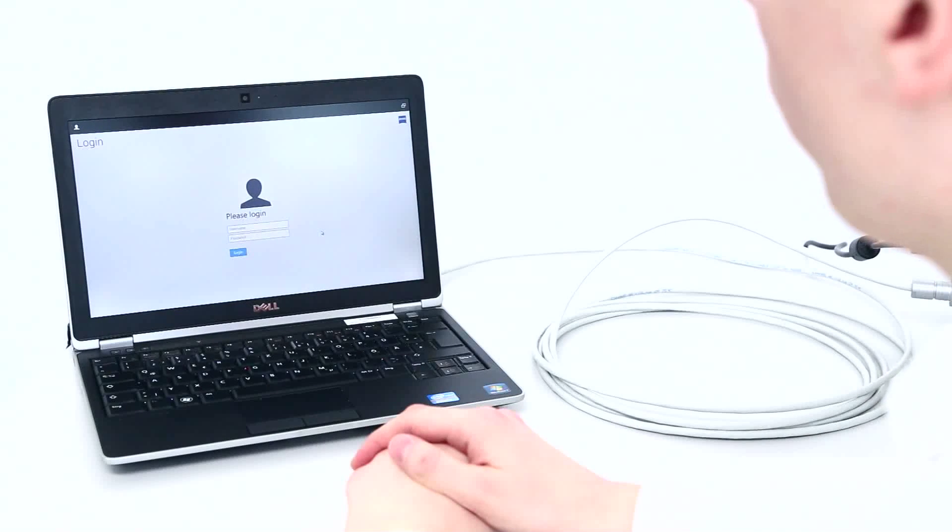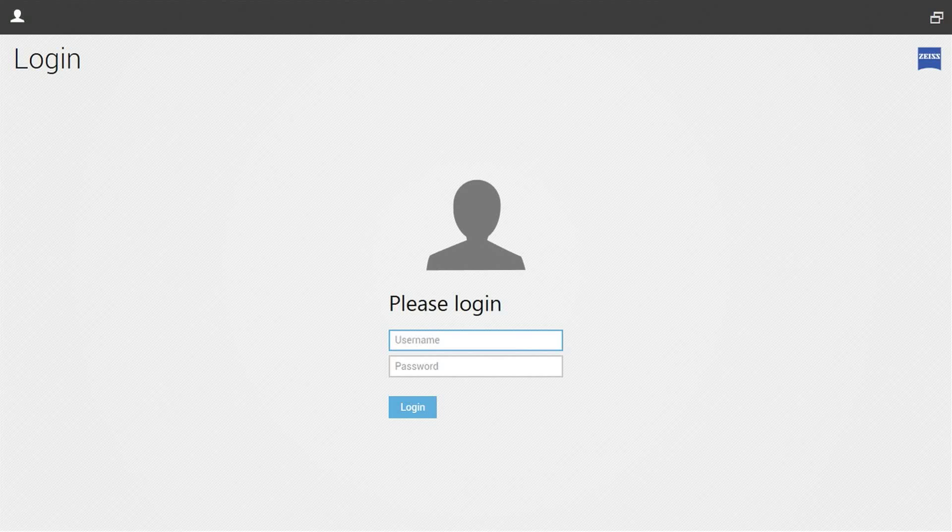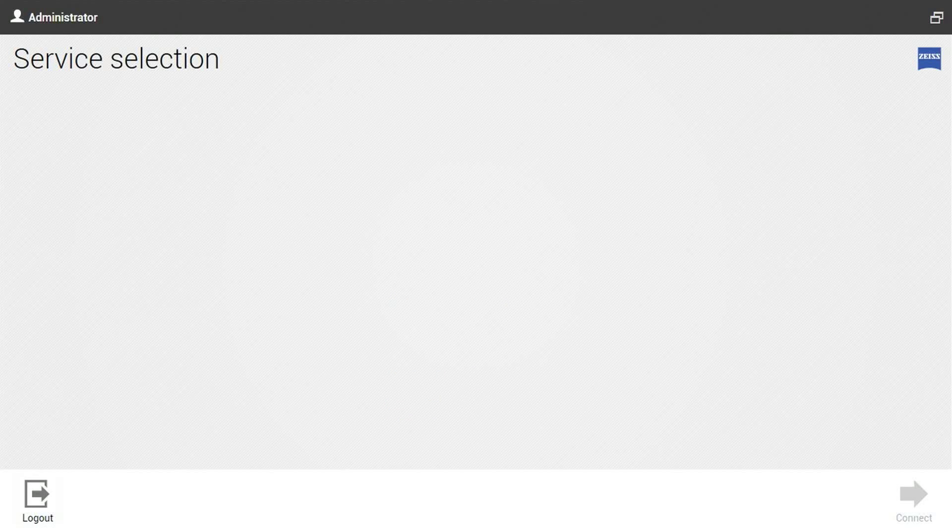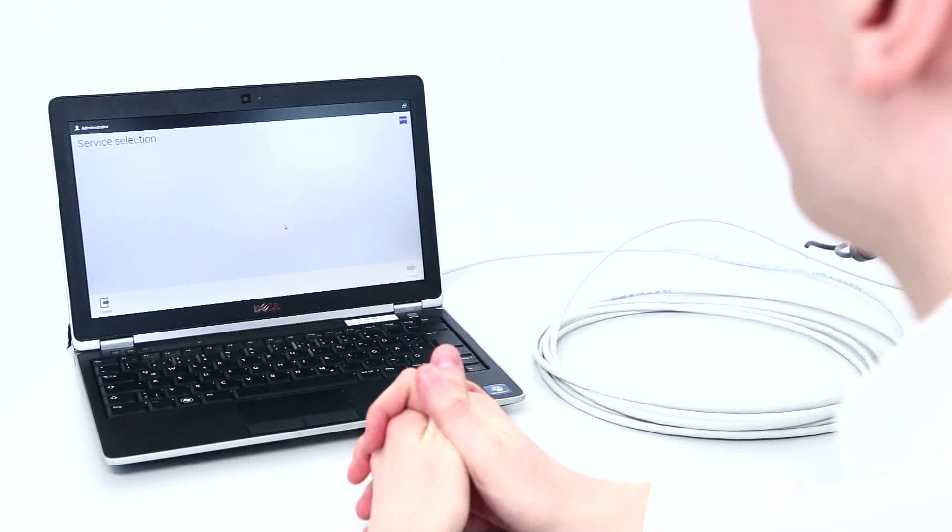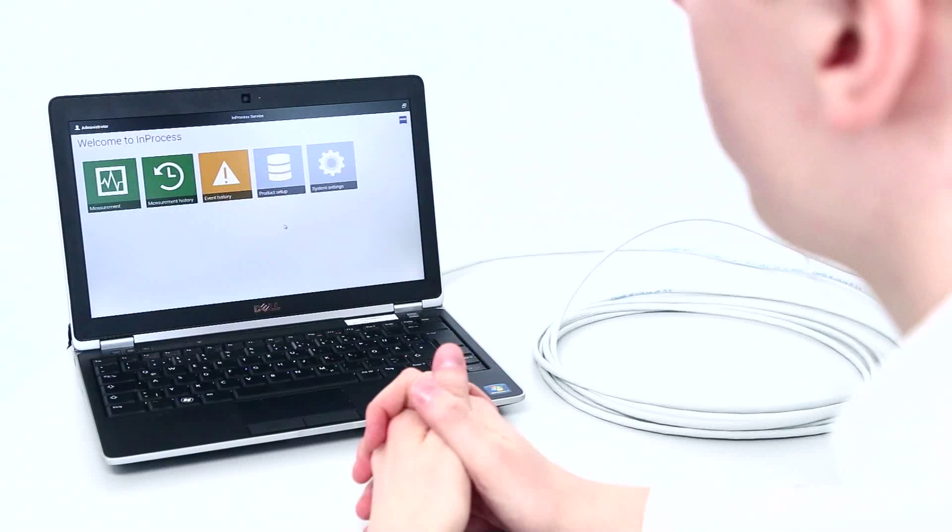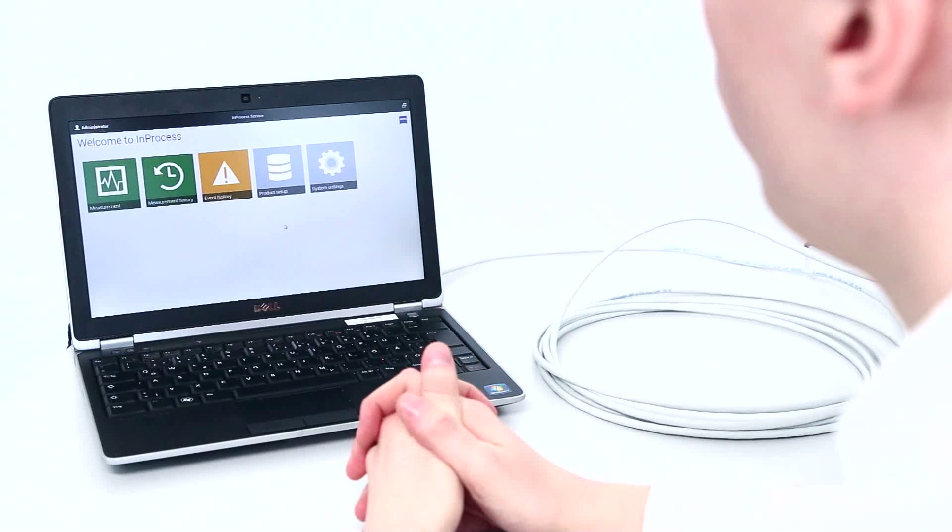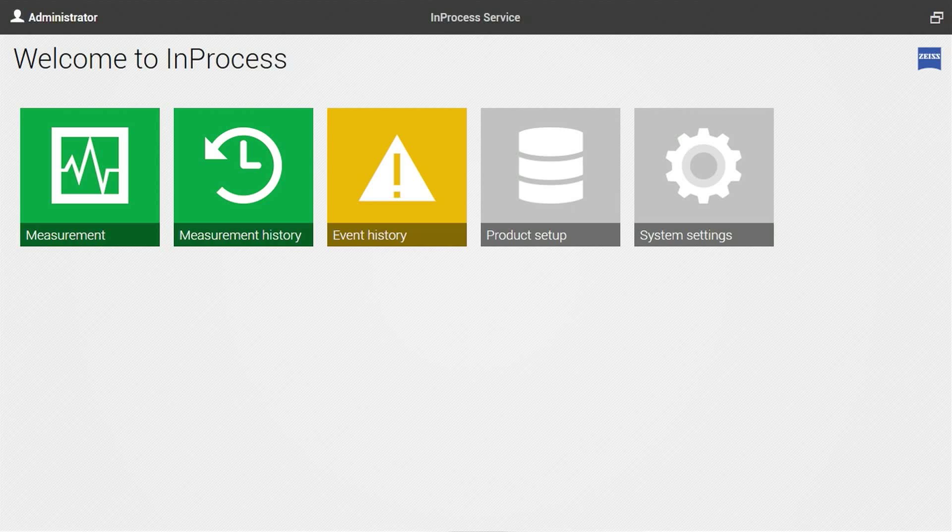After the startup of in-process, the user has to enter his credentials first. After successful authentication, the in-process software initializes the device and you are reaching the home screen.